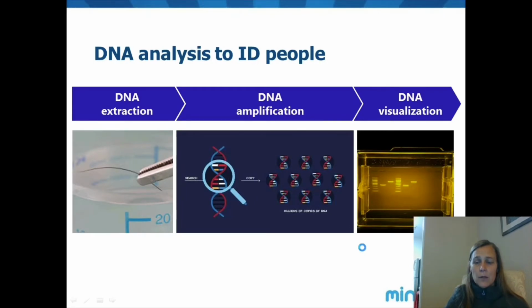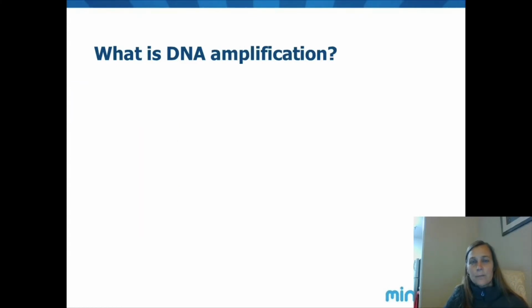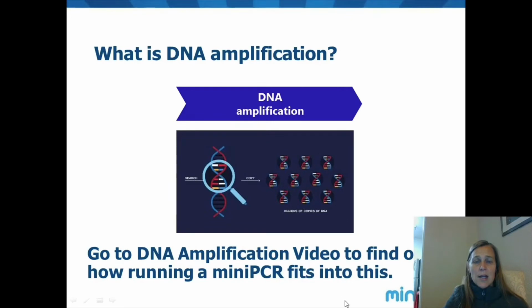Okay. So for our next slide here, DNA extraction. Again, you've done that. So you just extracted your own DNA and got to look at it. Now for amplification, okay? So now I'm going to run the video to give you a little better sense of what it means when you are running this machine called a mini PCR.